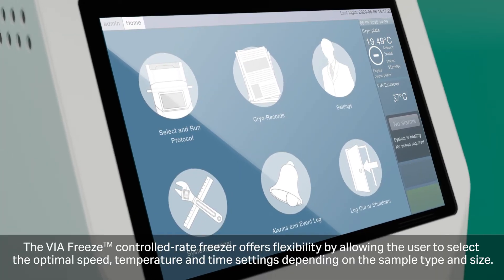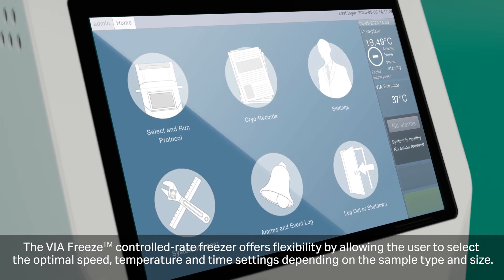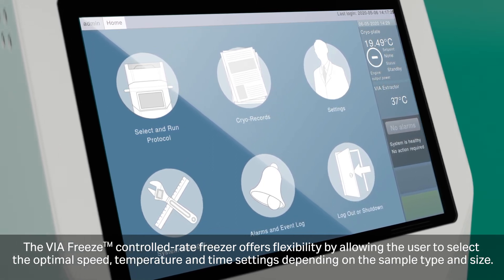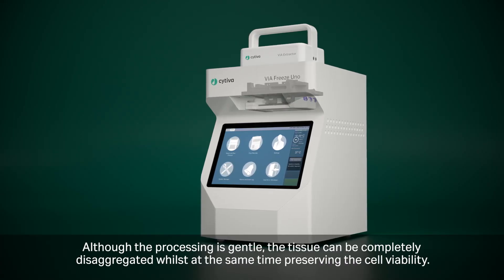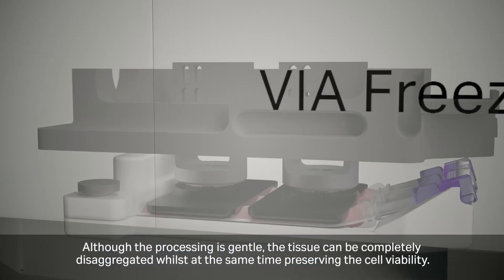The VIA Freeze offers flexibility by allowing the user to select the optimal speed, temperature, and time settings depending on the sample type and size. Although the processing is gentle, the tissue can be completely disaggregated whilst at the same time preserving cell viability.